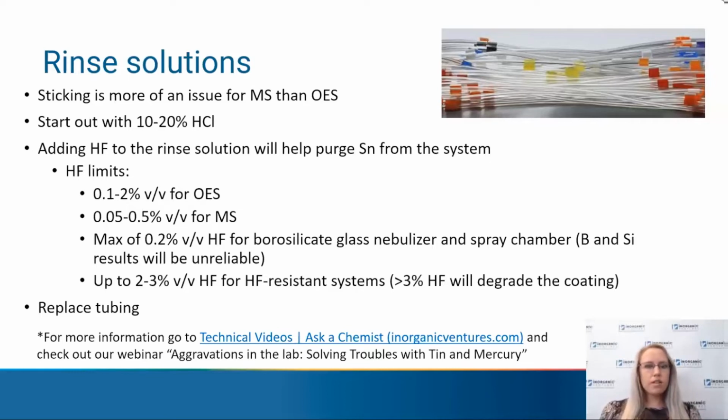So that concludes our quick tips for mercury and tin analysis, but we do have a webinar available on our website. If you go to the Education tab and Technical Videos, that webinar is called Aggravations in the Lab, Solving Troubles with Tin and Mercury, and that goes a little bit more in depth into some issues that we see for tin and mercury analysis on a daily basis.